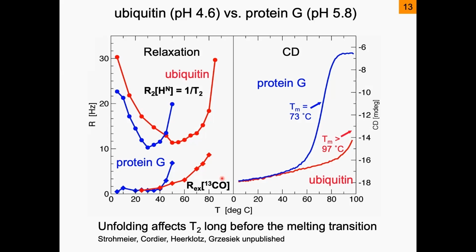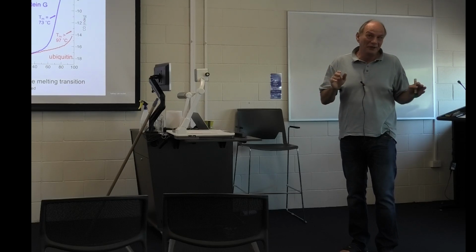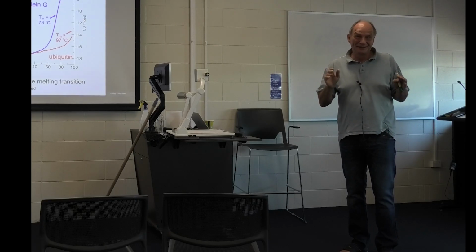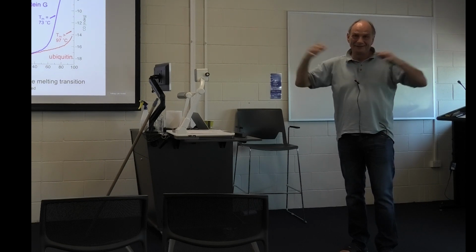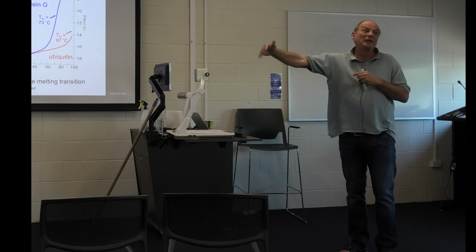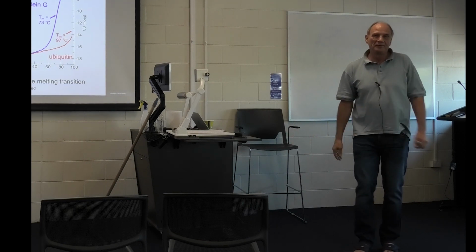And what you then see is that at about 60 degrees at high concentrations, 6 millimolar or so, it starts to precipitate. It does not precipitate if you use 1 millimolar at 60 degrees. But if the concentration is high enough, the protein is expanding and coming back together. But if there's a neighbor nearby, it just comes together and comes out of solution.